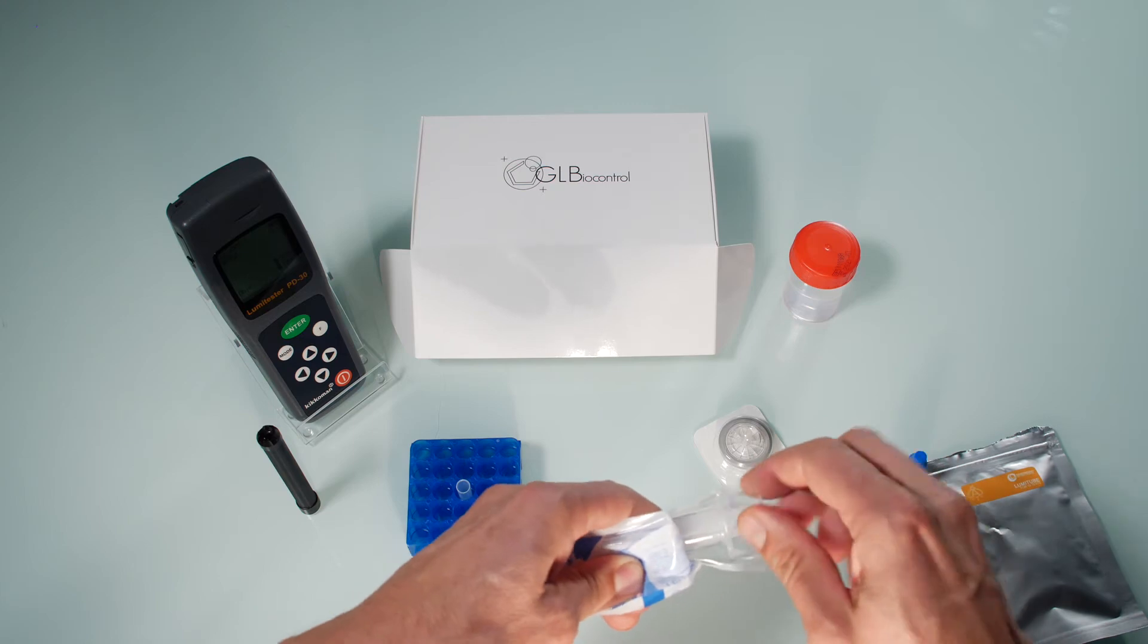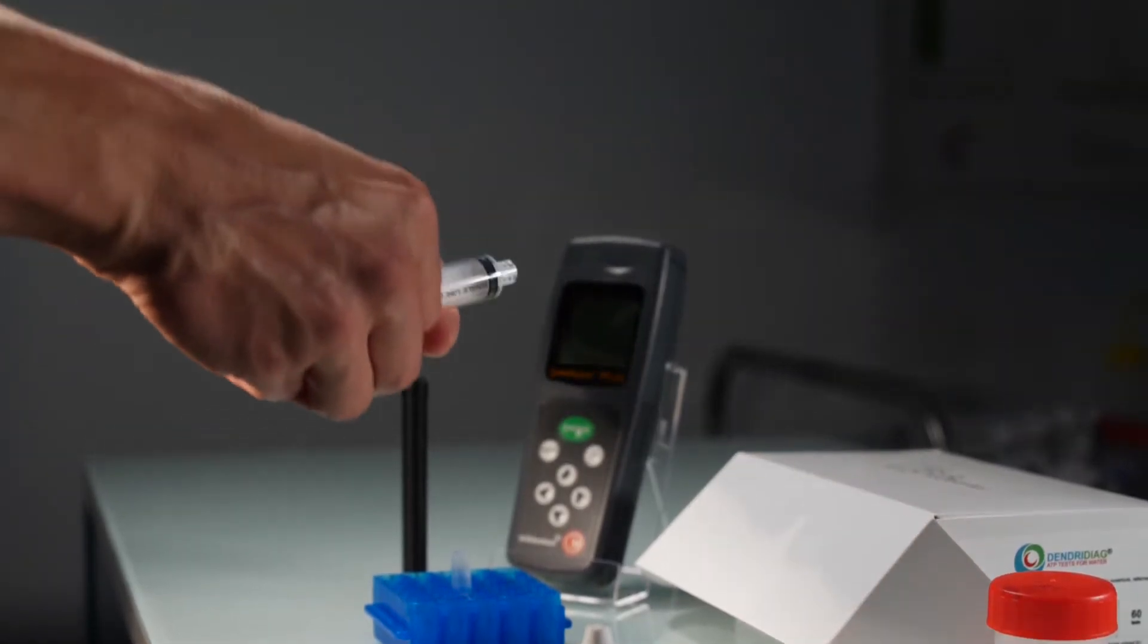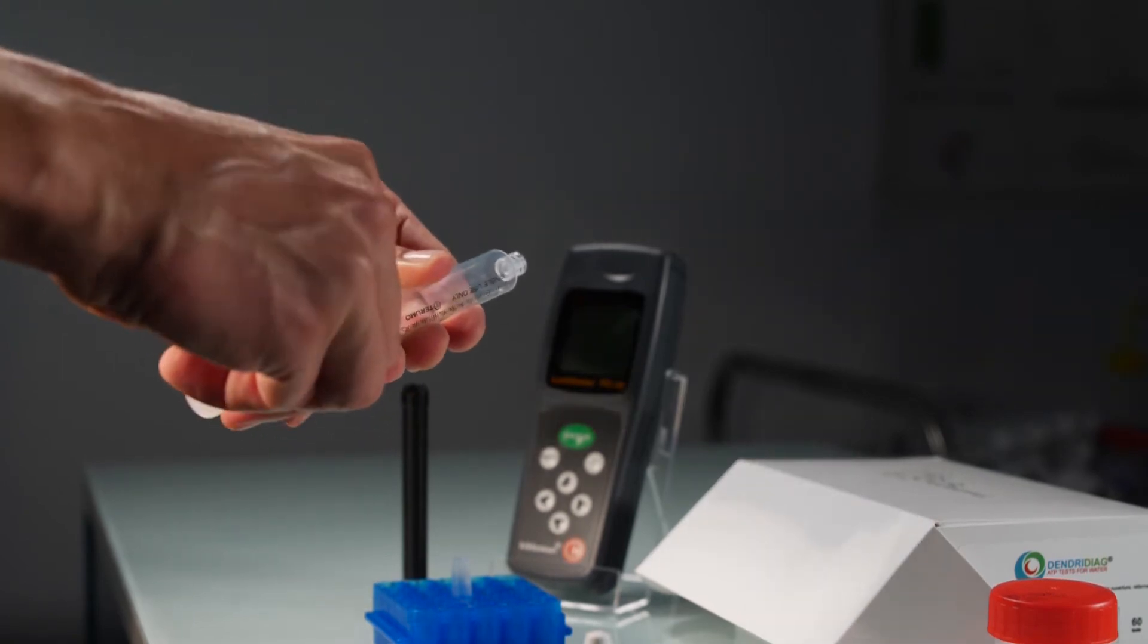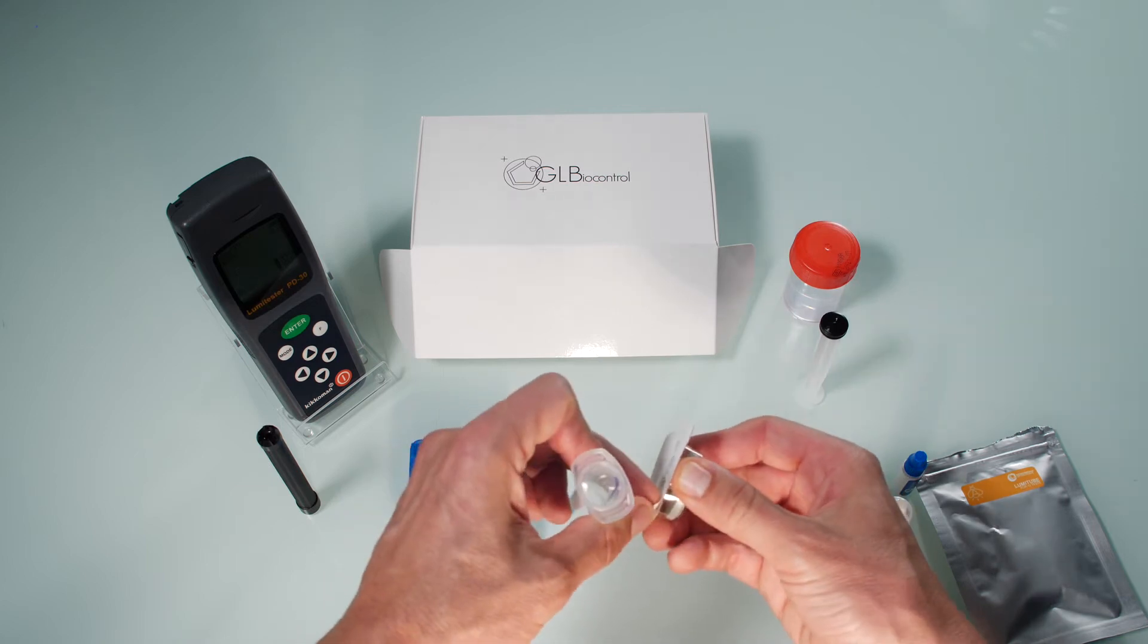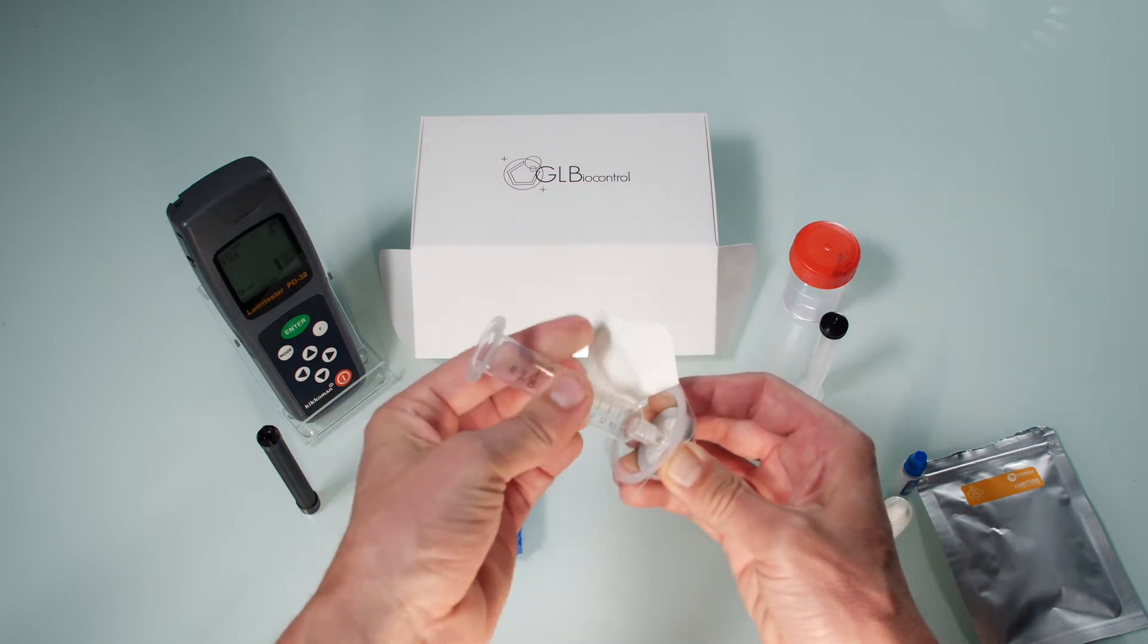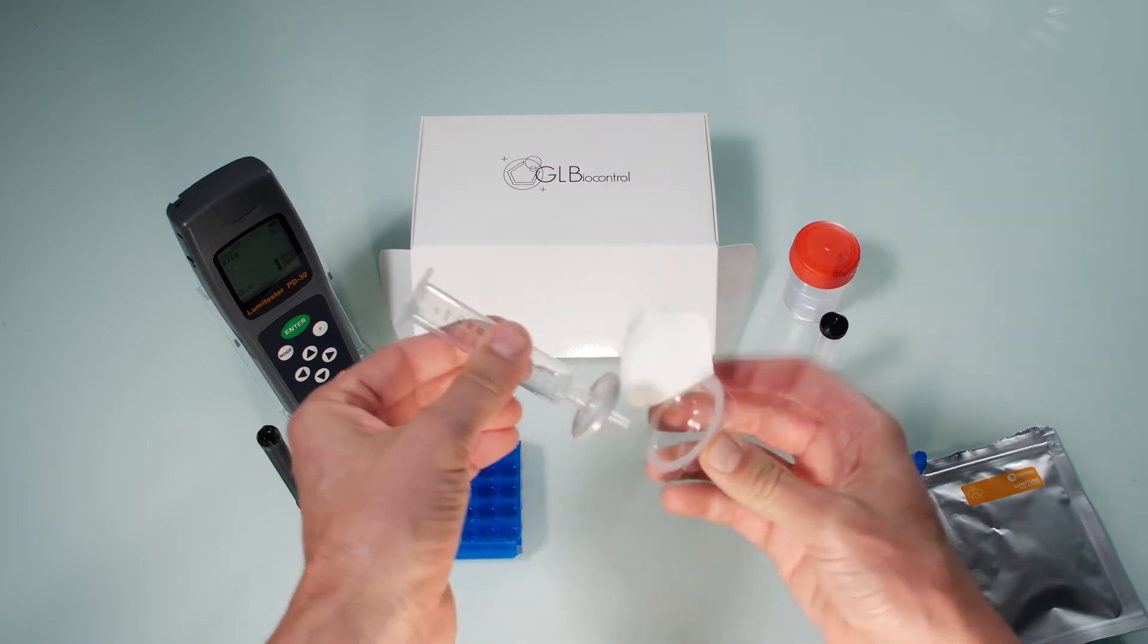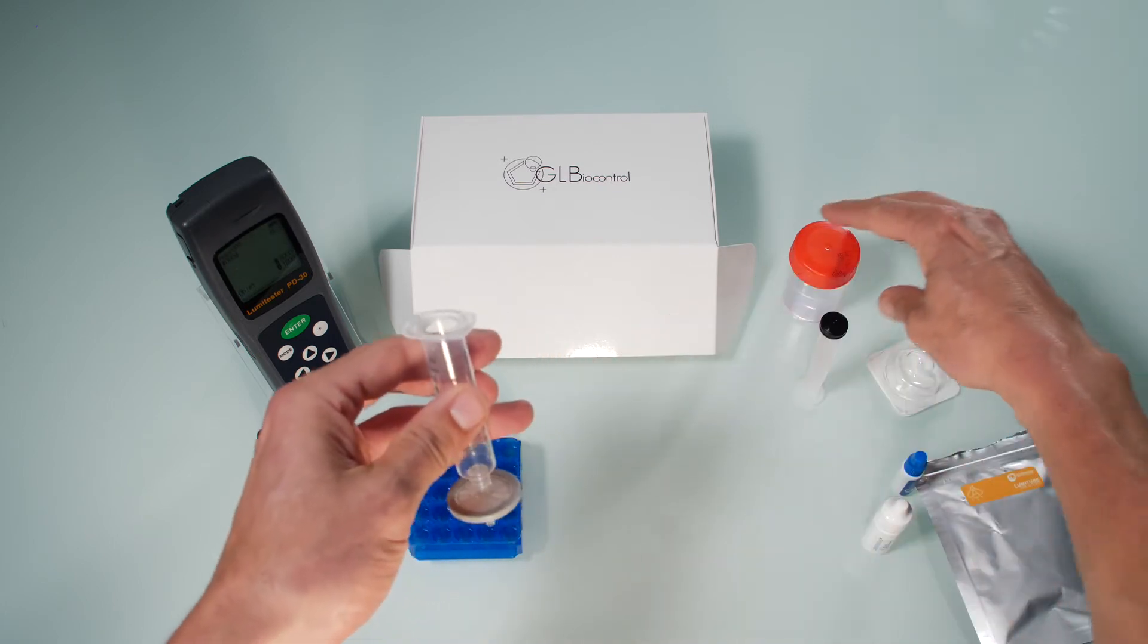Unpack the syringe being careful not to touch the tip. Then remove the plunger and put it on the work surface. Don't touch the black part of the piston. Peel off the cover of the filter pack and screw the syringe onto the filter. Keep the plastic packaging clean. It will be used later on.